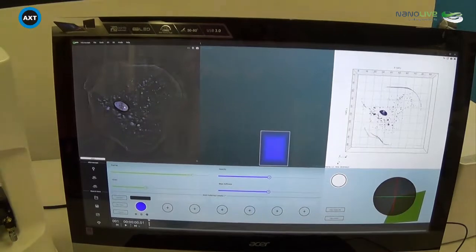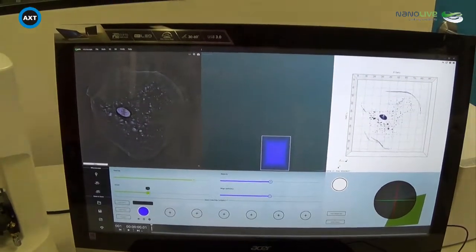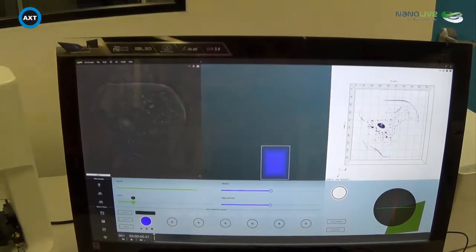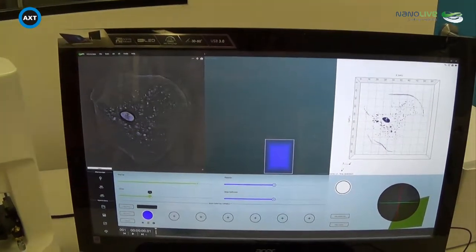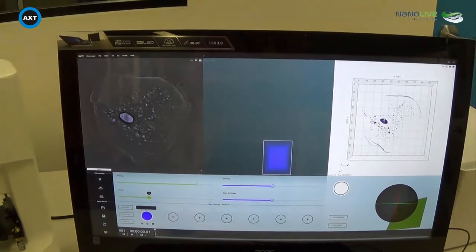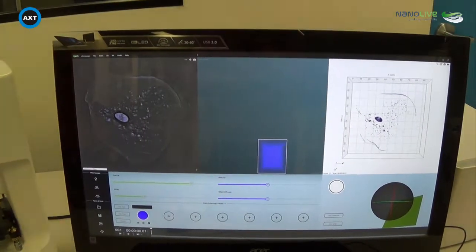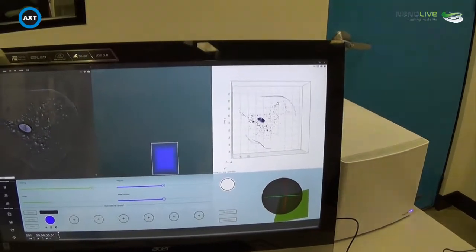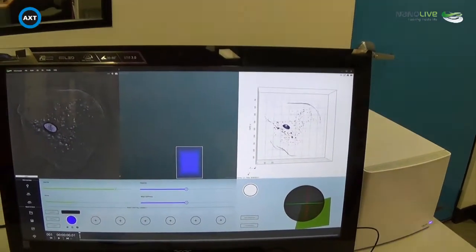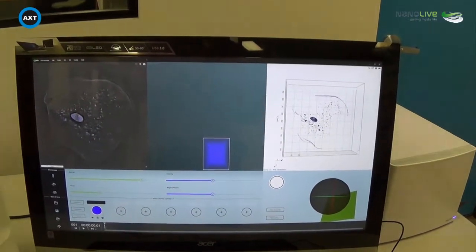it's found everything else within the 3D image and taken everything that has the same refractive index as those few pixels and given them all the blue color. So if we look across here at the 3D view of this cell, we're able to see a very clear nucleus that has been colored in blue by the digital staining.